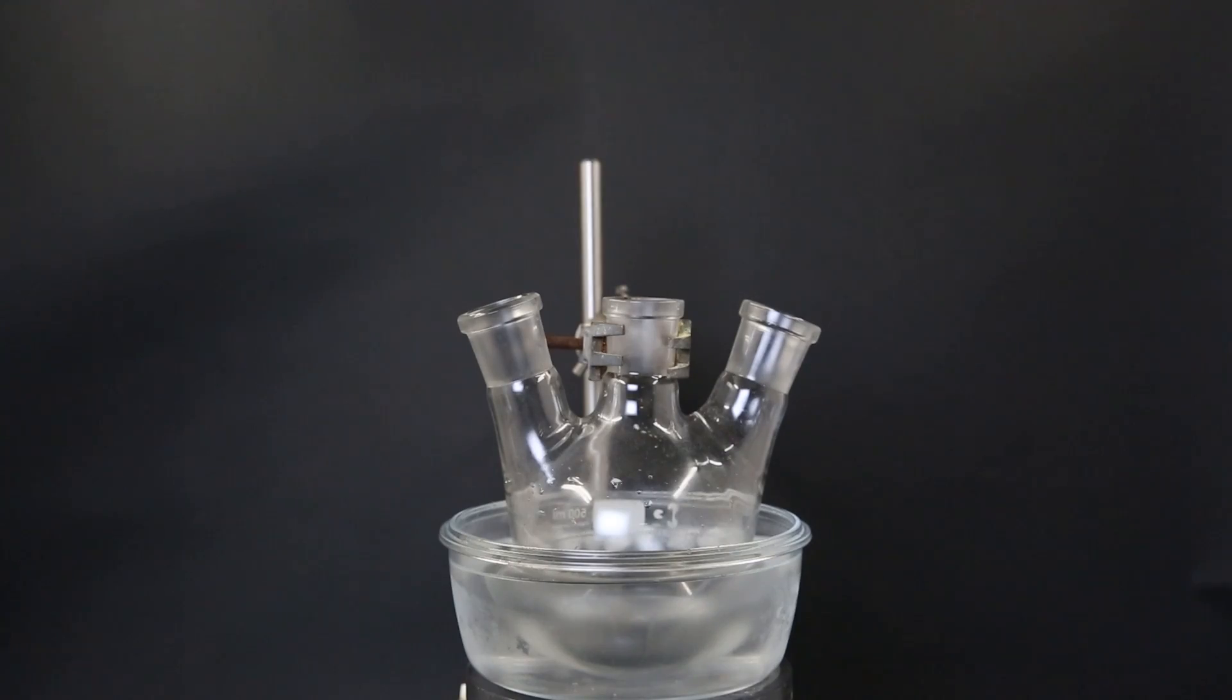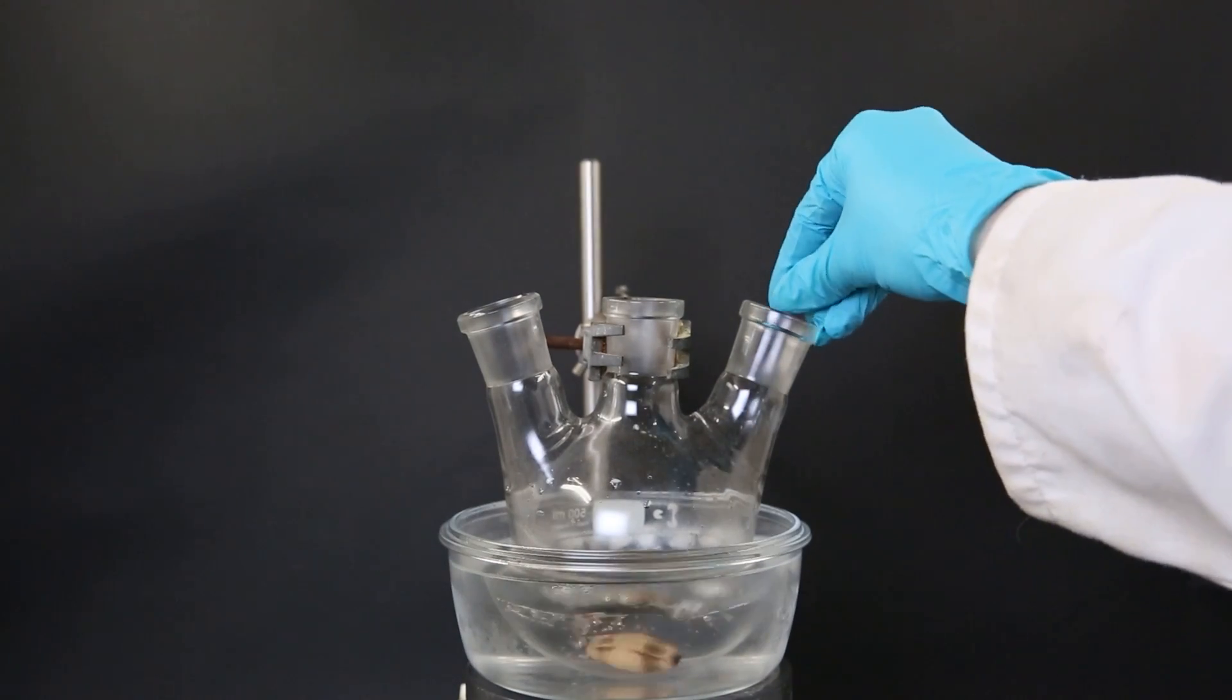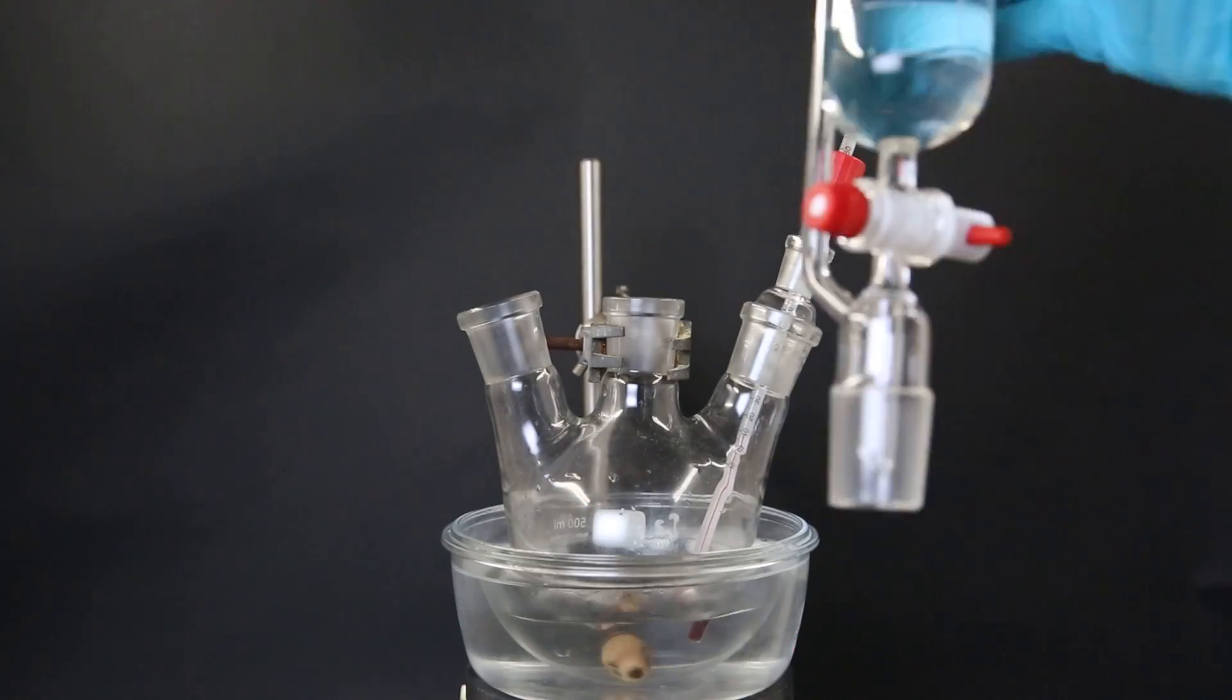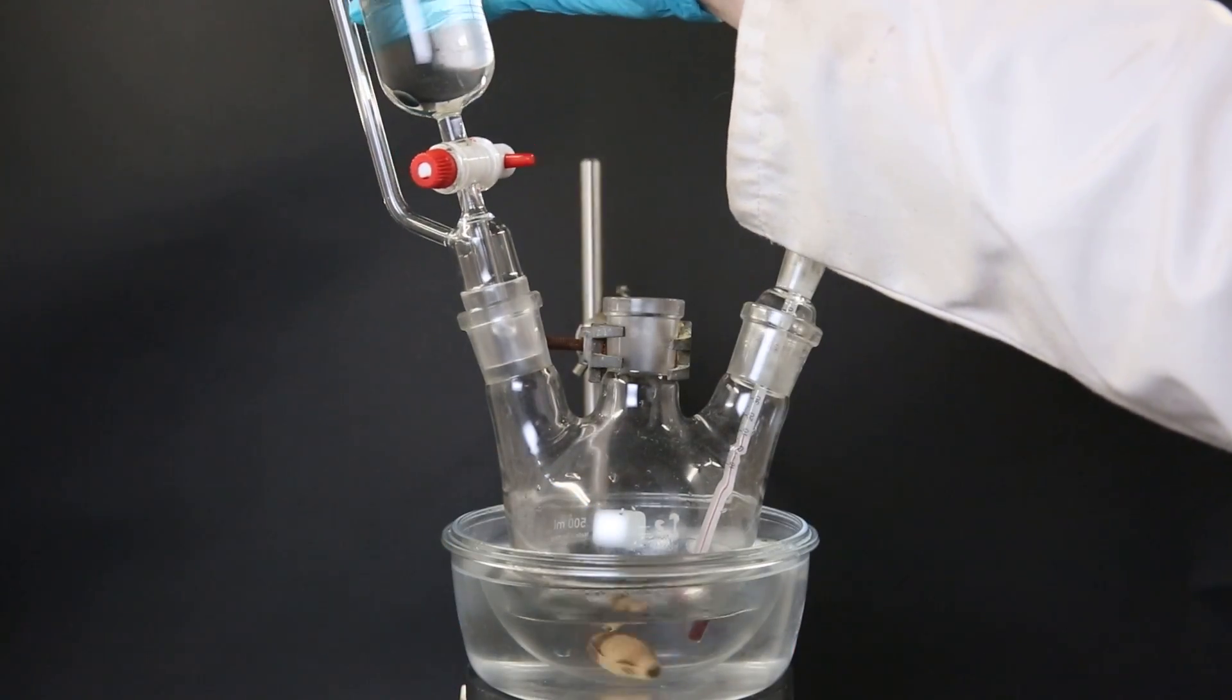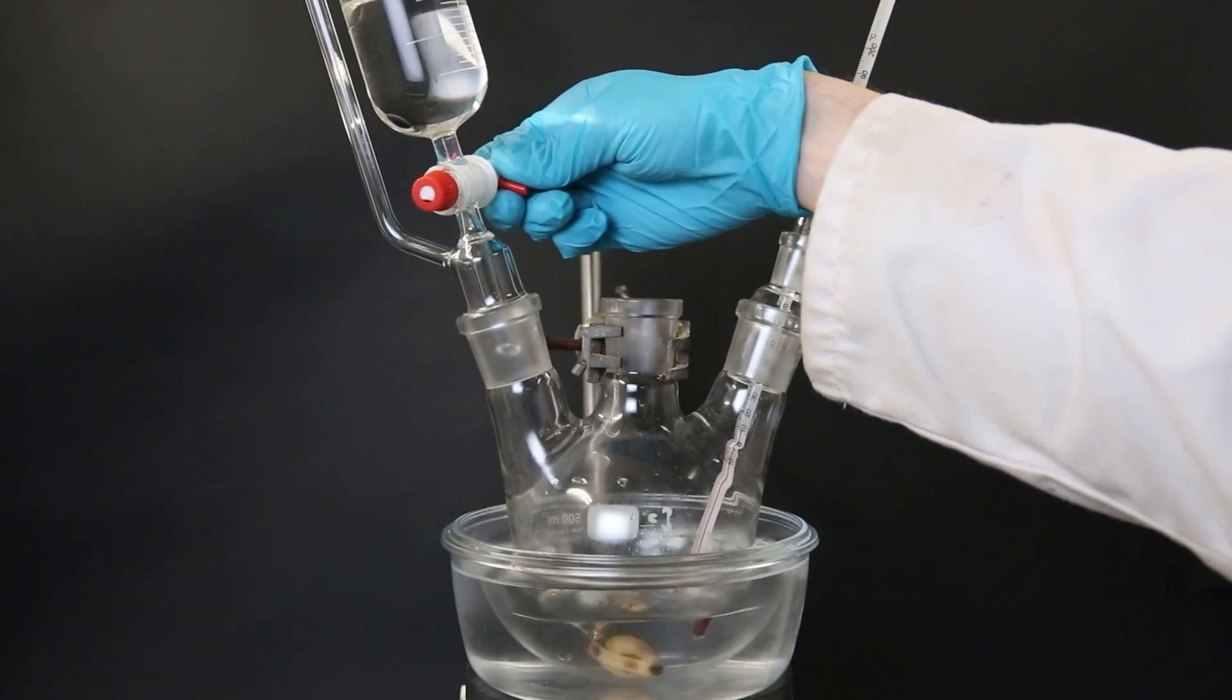So first, I set up a three-neck flask in an ice bath and I add 90 ml of ethanol. I drop in a stir bar, add a thermometer, and wait for the ethanol to cool down. Then I attach an addition funnel that contains 80 ml of concentrated sulfuric acid and add it dropwise to the ethanol.